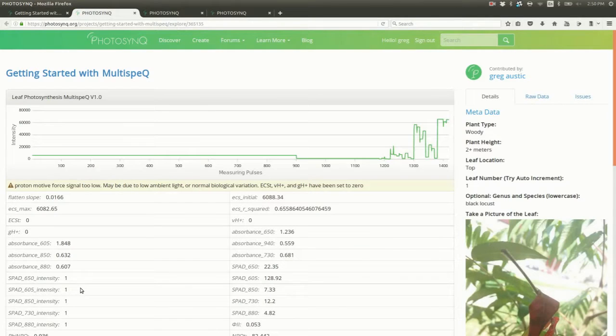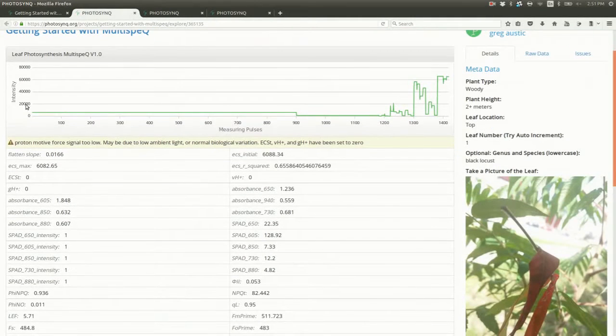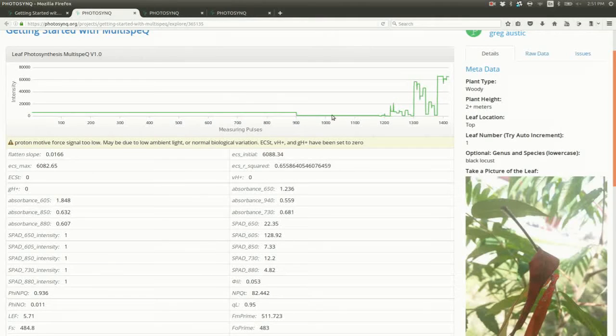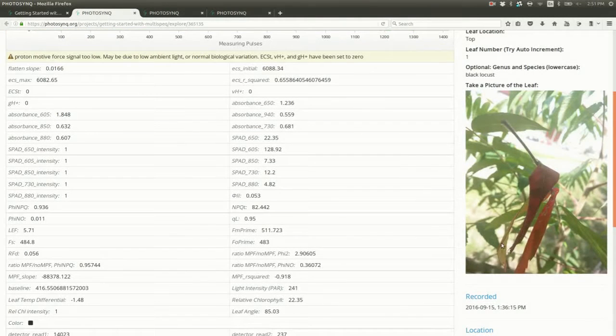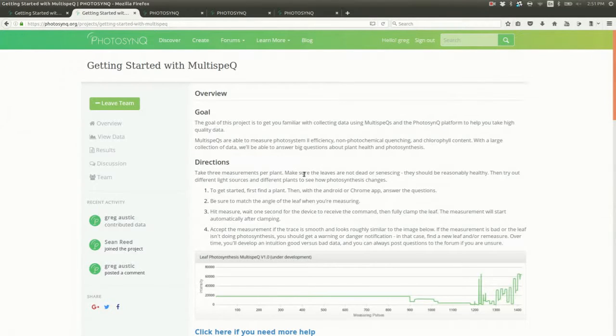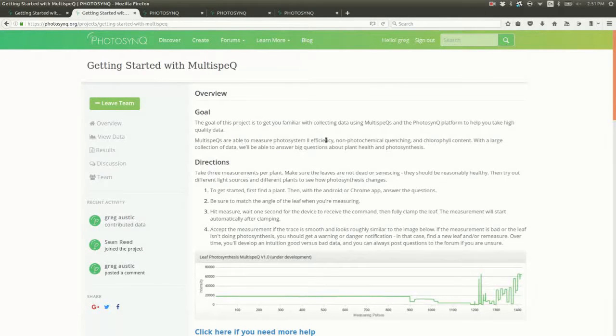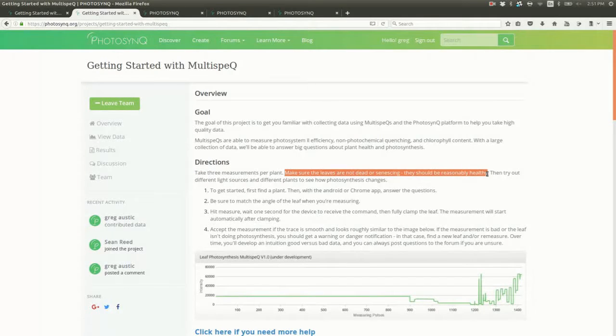Hmm, no fluorescent signal, and the leaf appears in pretty bad shape. We can flag this data point if we think it isn't appropriate. Let's see what the project directions say about dead leaves. Ah, okay, this project explicitly says we shouldn't measure a dead leaf, so we'll flag it accordingly.